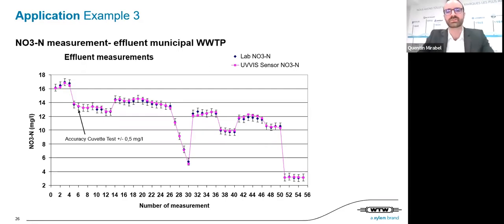So basically, it was just to give you an overview of our spectral sensor, the features, how it looks, and how we can measure parameters such as BOD or COD online. And now I suggest giving the lead to Georg again.